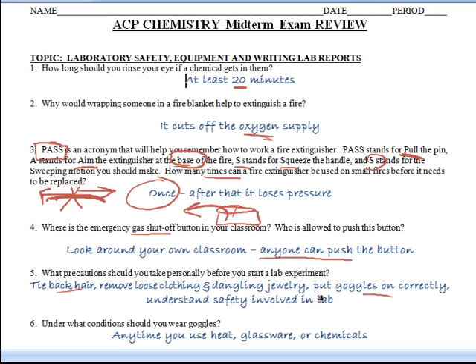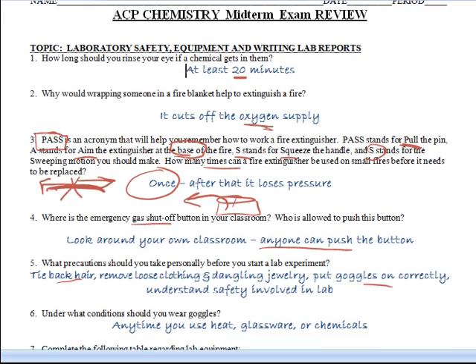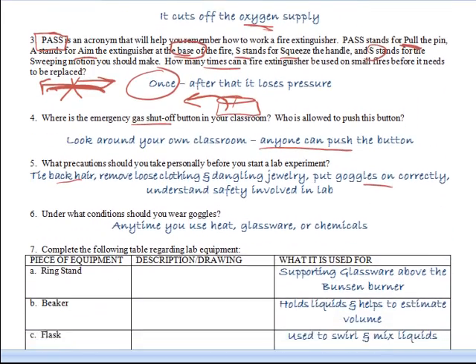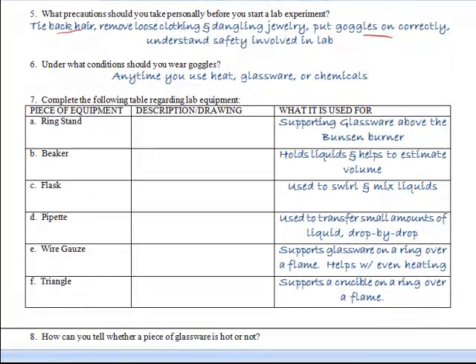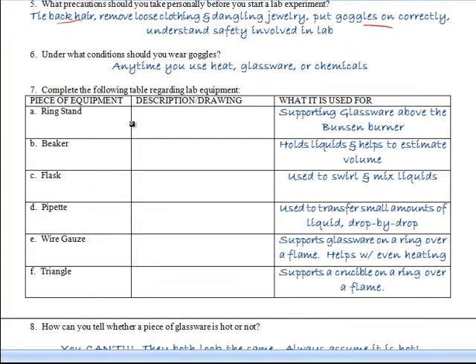Number six. Under what conditions should you wear goggles? All the time. Any time that you have heat, glassware, chemicals, anything like that, you should have goggles on your eyes. Now, in the beginning of the year, we started off looking at different types of equipment. I'm not going to show you here, but you can always go back into your notes and look at what a ring stand looks like, what a beaker looks like, and so forth.